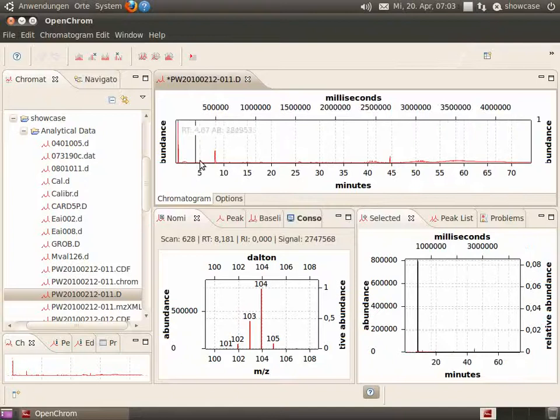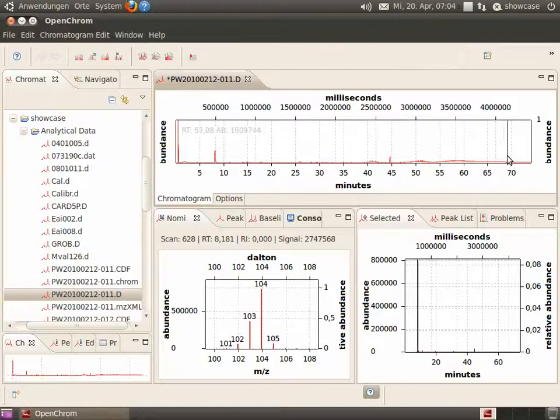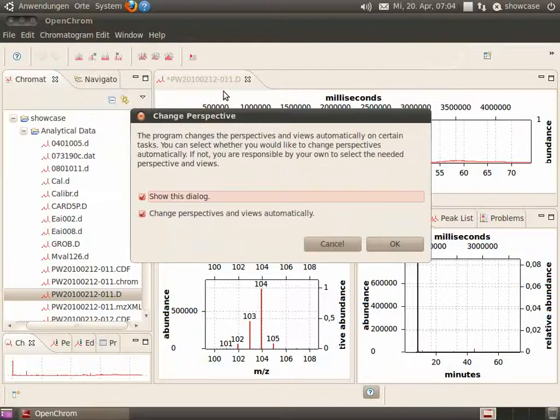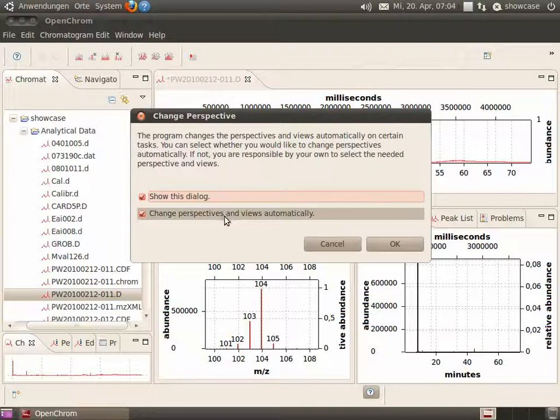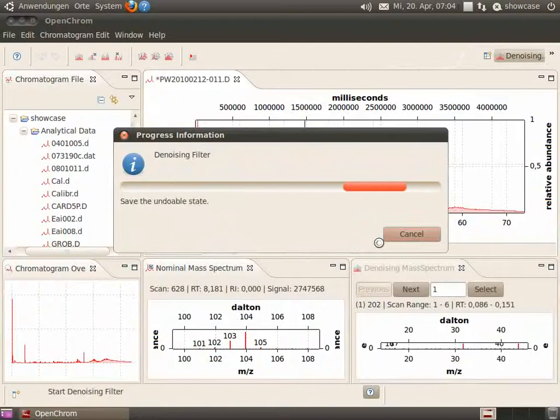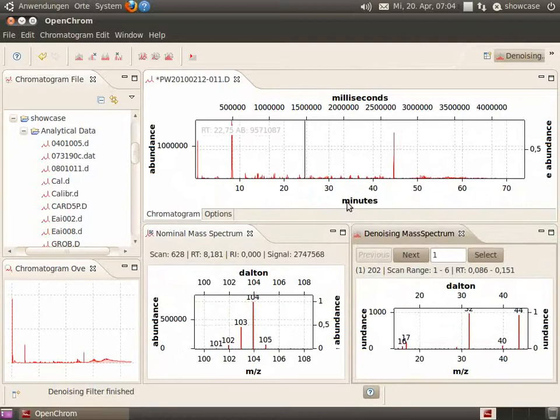Afterwards we adjust the range and we will use the filter to denoise the chromatogram. Go to the menu chromatogram edit and select the denoising filter. Now the perspective will be changed but you can deactivate it. Say okay and now we are in the denoising perspective.